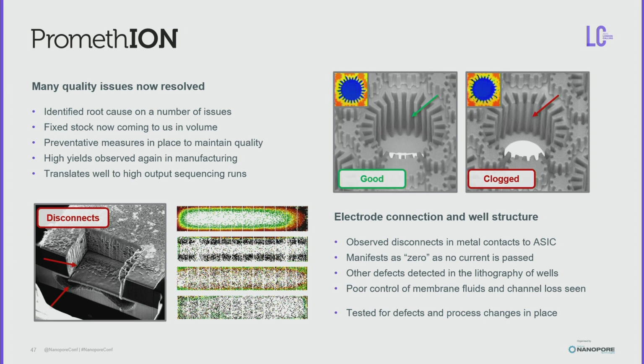On the right hand side, this is where the change in the metal has caused it to reflect the UV. This means that it's overexposed and those are clogged, and that means that structure just won't hold on to those fluids as well as we need it to. It will probably fail QC, but if it doesn't, it might fail in sequencing.